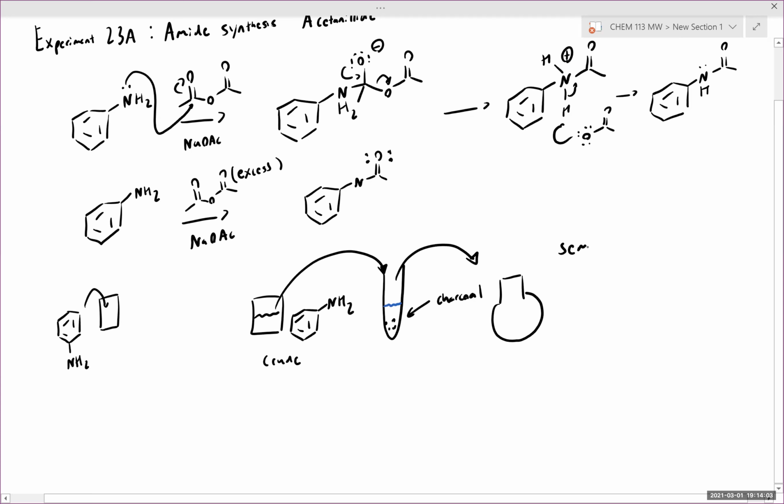We're going to be doing the semi-micro scale prep, which is scaled by a 5x scale. The reason why I'm bringing up that the aniline is purified over charcoal is that you may lose a small amount of aniline during this purification step, but purifying your aniline over activated charcoal drastically increases the efficiency of this reaction and drastically improves the purity of your final product.